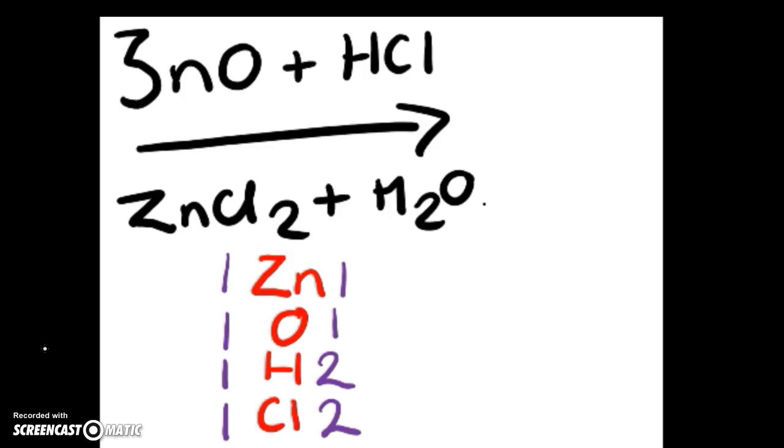So we look at our equation and we see what we can balance this on the reactant side. We put a 2 in front of the hydrochloric acid in order to balance this out. And so this gives us 2 hydrogens and 2 chlorines on the reactant side, and therefore our equation is balanced.